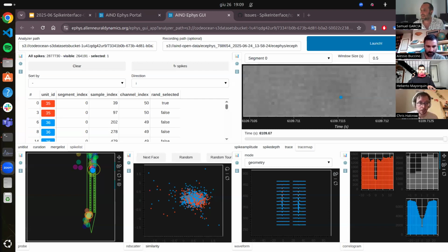Sorry, there was a question earlier that I thought might be good for everyone: how does this scale with the number of units? If you have 1,000 units or several thousand, what are the computational requirements? At the moment, hundreds is fine, 500 is fine. If you have thousands, it starts to be a bit slow, but we've done a first round of performance improvement, and I think the next thing we need to focus on is to make it really scalable.